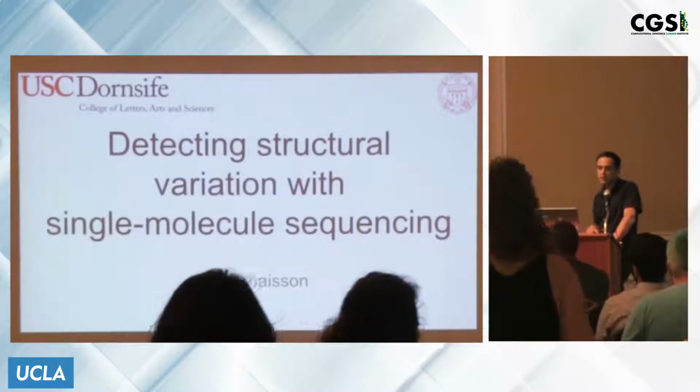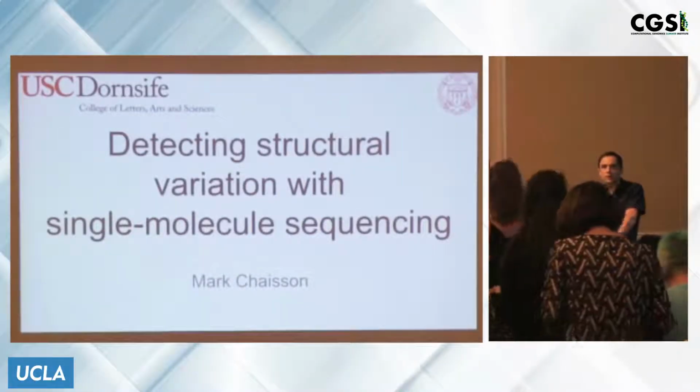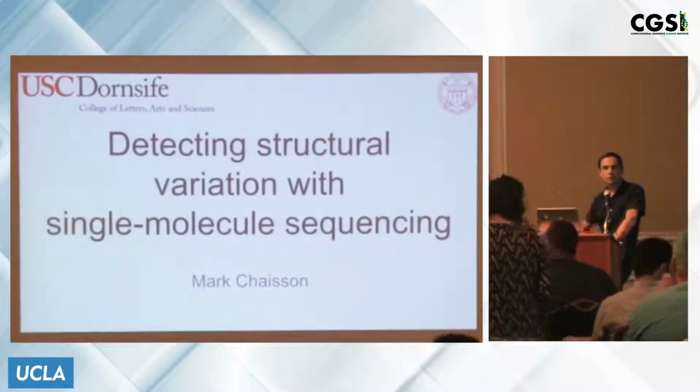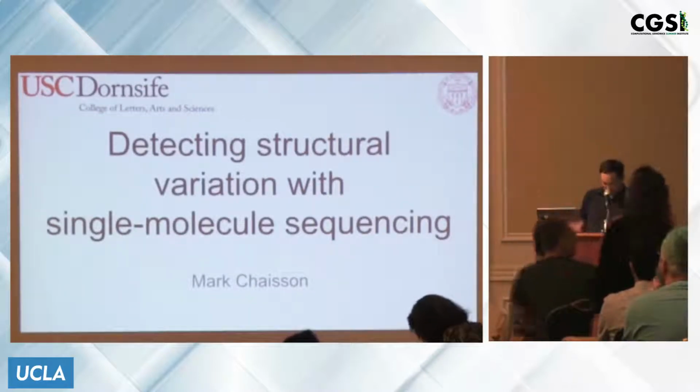So today I'm going to talk about detecting structural variation with single molecule sequencing. And it's a bit of a tutorial, a bit of a survey, and a little bit of background methods all kind of rolled into one.